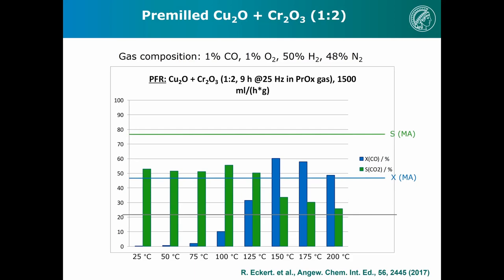There you have what you expect. Increasing temperature, increasing conversion, and sometimes it deactivates. We never get the kind of activity and productivity we get in the mill. It tells us we have a very special effect here. It is not thermal, but probably high activity effects, transient defects we create, which are not persistent in the plug flow reactor. It behaves more or less normal.